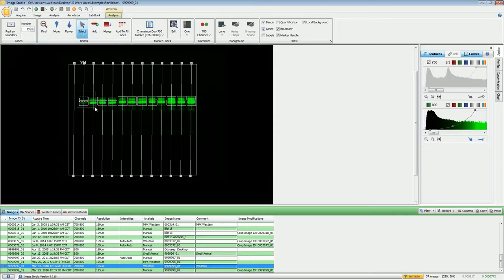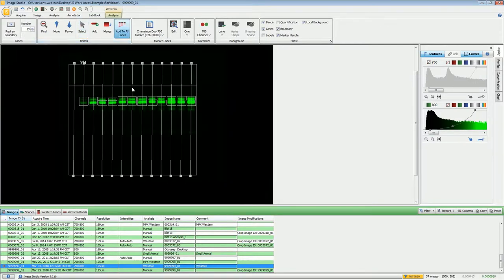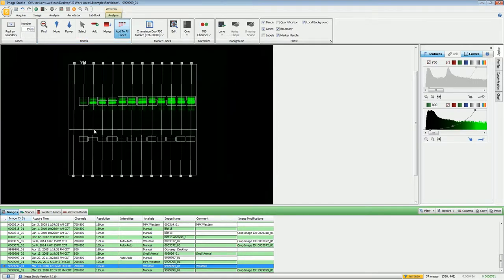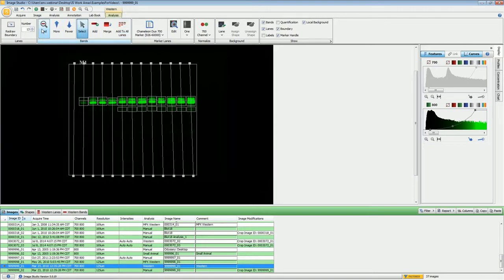If you want, you can also merge bands together. If it found a doublet but you want it analyzed as a single band, highlight those bands and click the Merge button — they will now be merged into single band markers. If you want to add a band to all lanes within an image, click Add to All Lanes, move it to where it needs to be, click, and it will find all of them within the image.